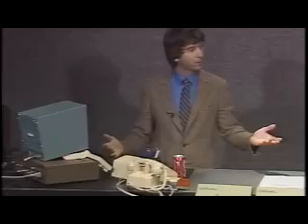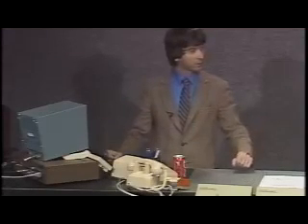Now, before I show you the variations that allow us to look at semiconductors and glasses, I want you to think about this. Remember, I was showing you images of field evaporation in which we had a field ion microscope pattern that showed you what was going on. Imagine we pump the gas out. After all, these ion species are being removed from the surface one atomic layer at a time. They're striking a detector. We should be able to image them directly, right, without a gas.